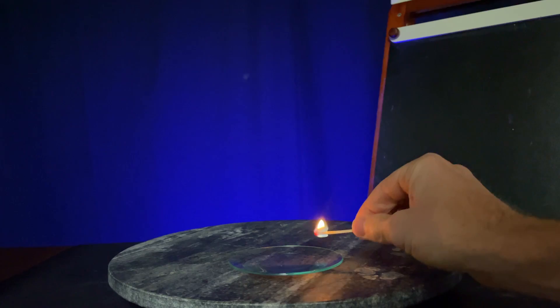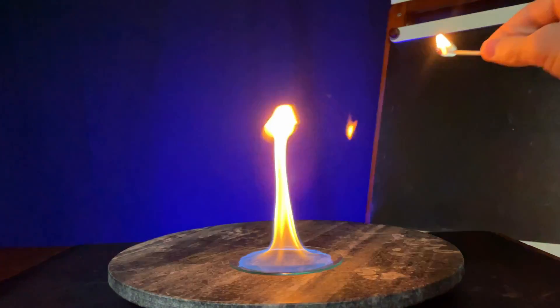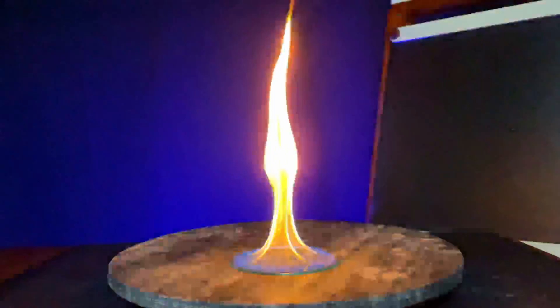We'll start the reaction with a match. Notice how long this initial light takes. This is better observed with 70%, but the flame comes through poorly on camera. We'll light it again in a moment. You might be surprised at the difference.